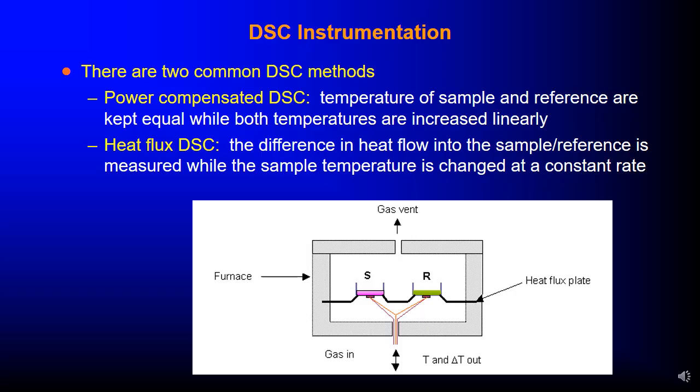In heat flux differential scanning calorimetry, the difference in heat flow into the sample and reference is measured while the sample temperature is changed at a constant rate.